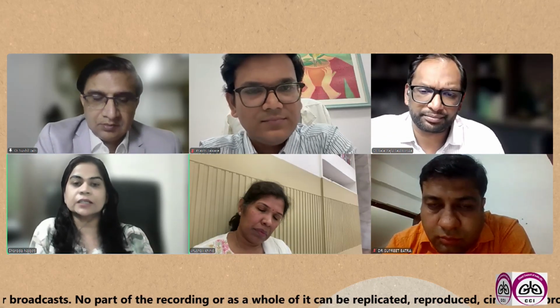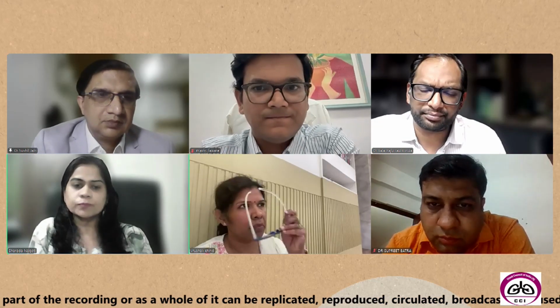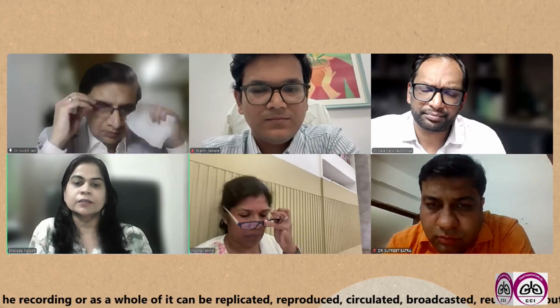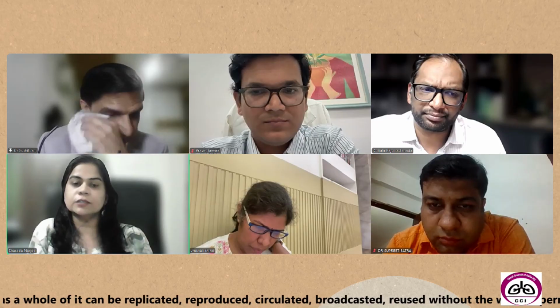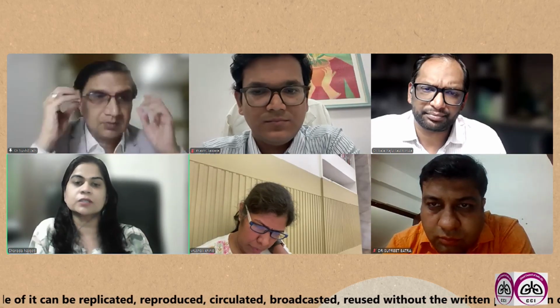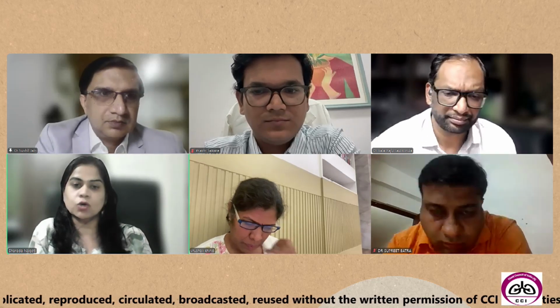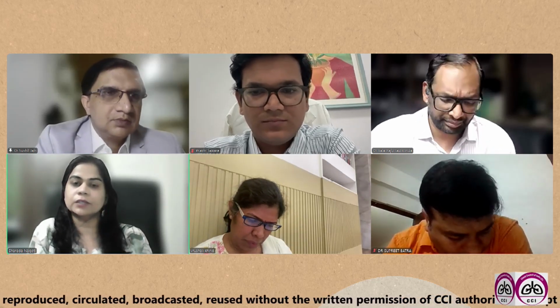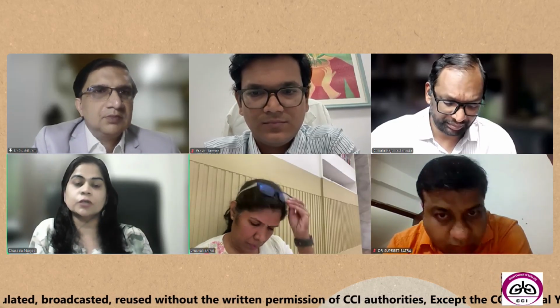Now coming to the technical pitfalls. The most common technical pitfalls that we encounter are poor smear spreading, where the spread is not uniform or even. The other is a thick smear, which is made whenever the material taken is in excess. In that case, it is very difficult to interpret the morphology because there is overlapping of the cells, and the morphological details are not clearly seen.